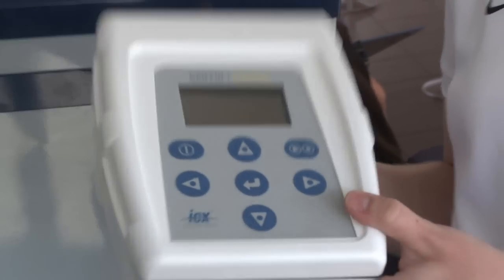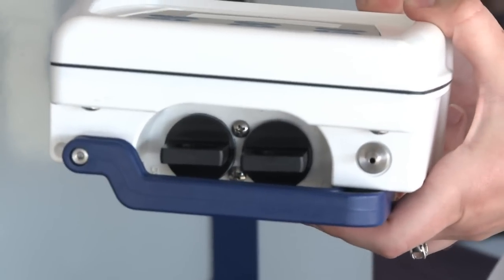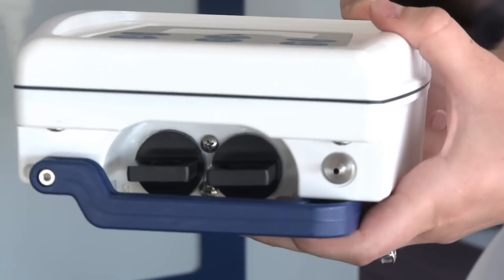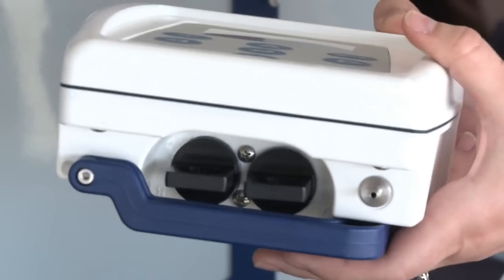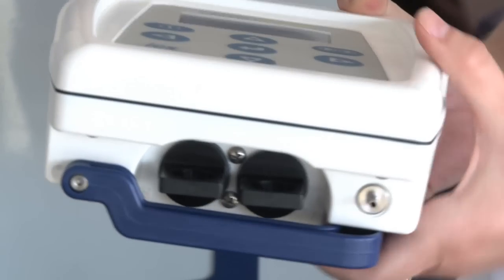It has two sorbent tubes on the bottom. You can sample on one tube, the other tube, or both simultaneously, which you would want to do in cases where you keep one for chain of evidence and the other for the actual analysis. That becomes very valuable to some people.